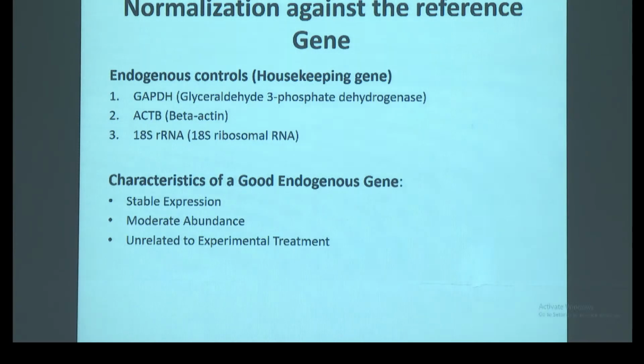We use endogenous controls. Endogenous controls are housekeeping genes whose expression is constant with any stimuli. आप you give any stimuli, उनका expression it will remain constant. अगर आप वायरस का इन्फेक्शन भी दिया है तो उस जीन को कोई मतलब नहीं है, वो अपना काम कर रहा है, उसका एक्सप्रेशन कांस्टेंट है. So you have to check it. वो ऑलरेडी पब्लिश्ड है जीन, तो कोई बात नहीं कि हाँ ये एंडोजेनस कंट्रोल लिया जा सकता है वायरस के केस में. So you use that.